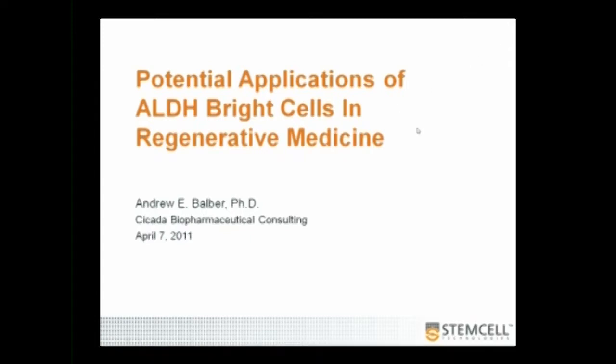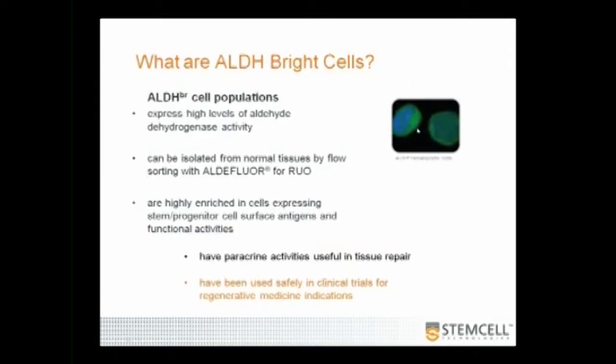Thank you, Andrea. And thanks, everyone, for tuning into this webinar. I'd like to start by outlining what ALDH bright cells are. These are populations of cells with high levels of an enzyme, Aldehyde Dehydrogenase. You see a picture of some of those cells on the right there. You notice that there's a cytoplasmic fluorescence. That, in fact, is where the presence of the enzyme can be detected, and what the products we'll talk about.